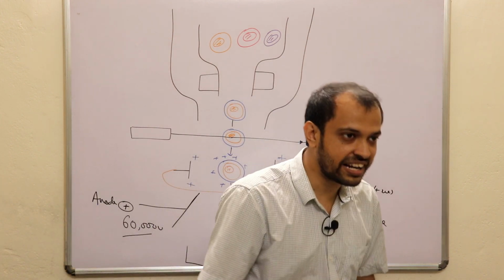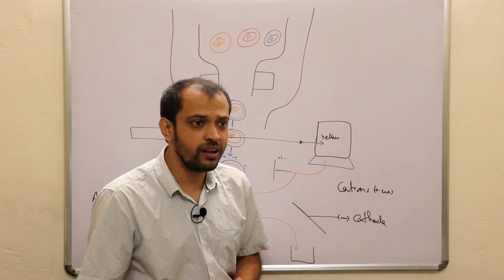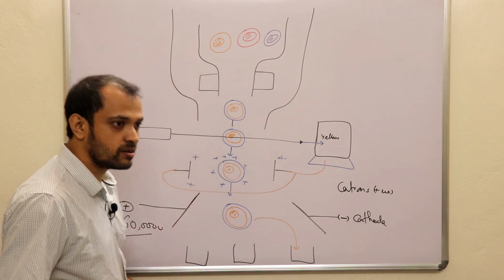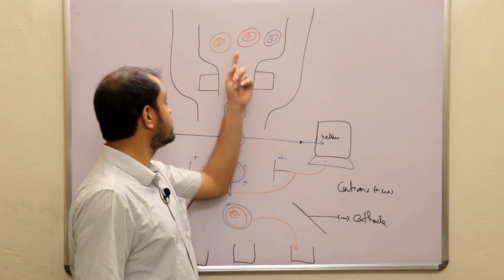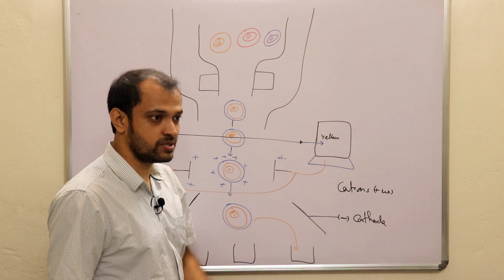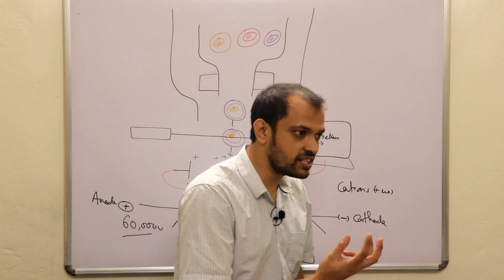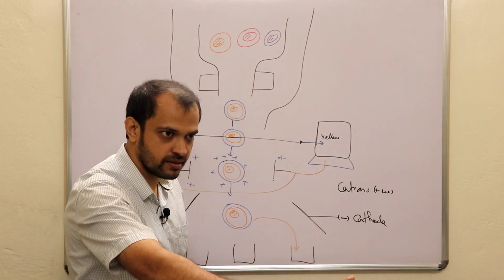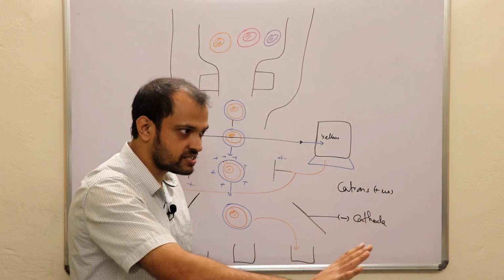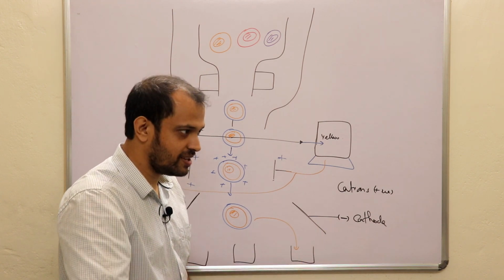Now listen, in practice, it is very important for you to understand how a cell sorter will know which one is a yellow cell, which one is a red cell, which one is a blue cell. There are no such blue or yellow cells in your body, right? You are not an extraterrestrial animal, unlike some.